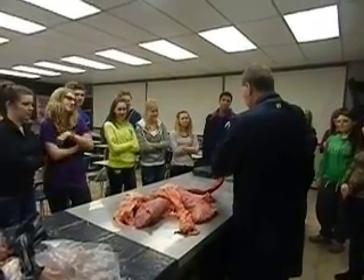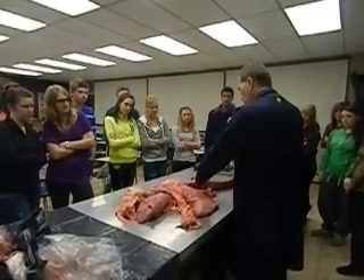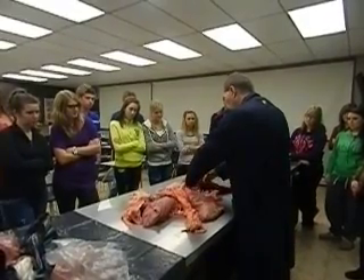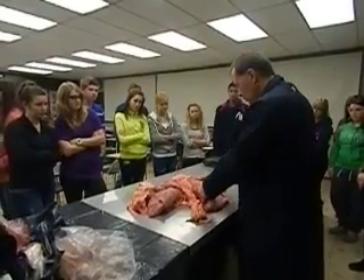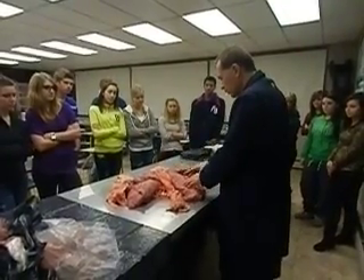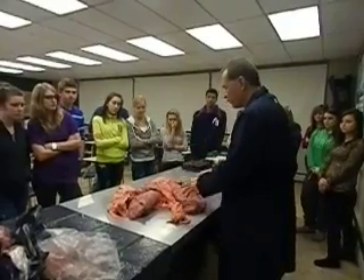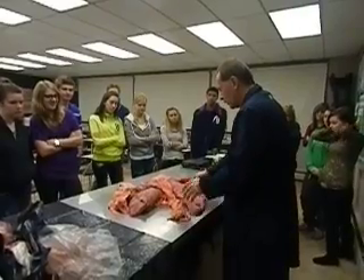What I usually like doing is filling this up with air right in here, but if I do that now it's just going to blow out here. So what I've got to do is bypass it and shove my air into here. I'm actually going to try to fill up these lungs. The biggest thing I'm going to try to show you is how many blood vessels are actually in your lungs. As you saw from the surgery, you start doing any work on the lungs — that is nasty. There are so many capillaries going through the lungs that it's just a tough thing to operate on.